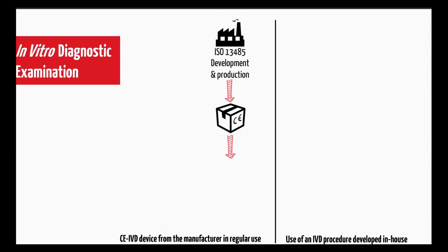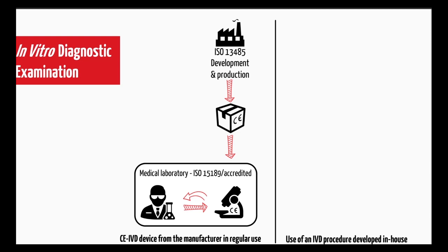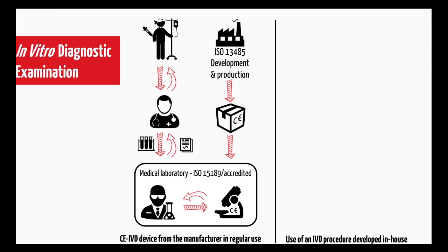In the normal situation, a certified manufacturer would provide CE IVD products to the laboratory, and the laboratory is accredited and puts these devices into service and provides the service. Then the patient comes to the physician with the symptoms, a sample is taken, it's being analyzed, results are sent back to the physician, and the patient gets treated or gets a treatment recommendation.